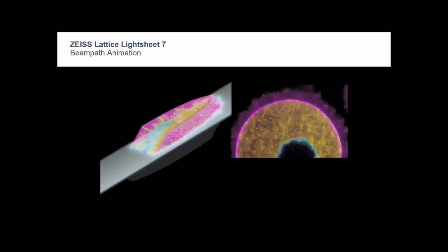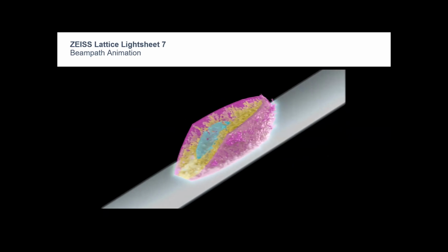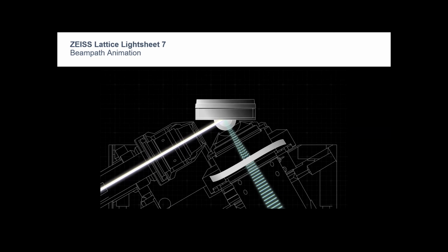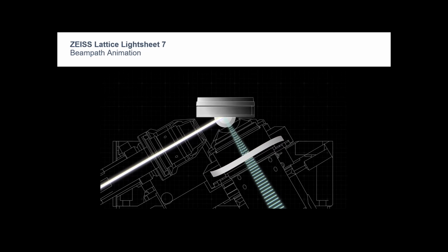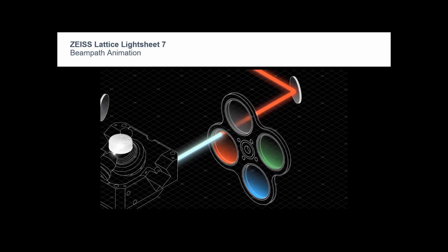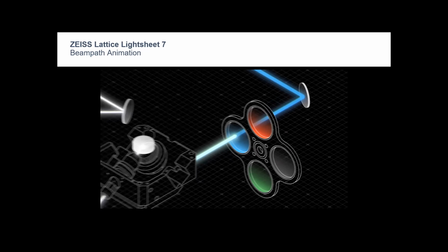through a meniscus lens, and this meniscus lens basically decouples your excitation and detection optics from your cover glass. You can also see it comes in at an angle, so it always excites a 45-degree angle Z stack at the same time. So what is being detected by your emission lens is now not cover glass aligned. So you can then throw different emission filters in there and detect this lattice light sheet.